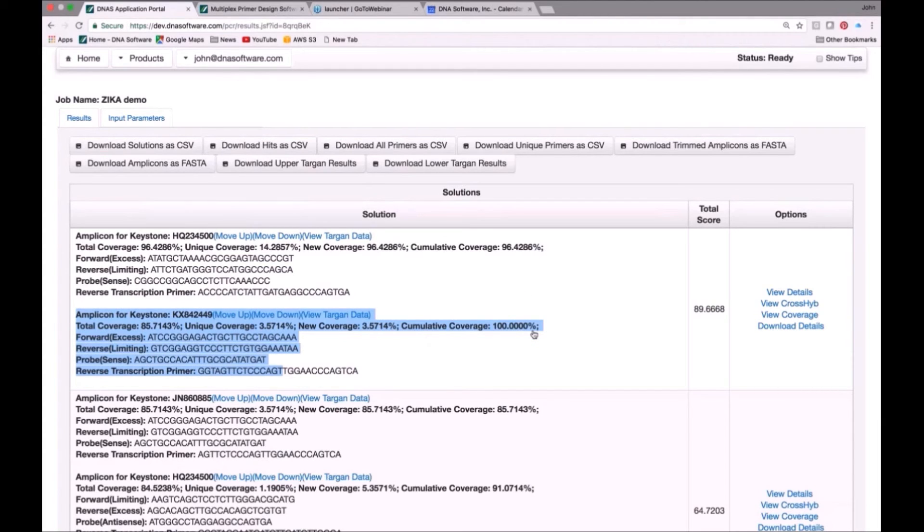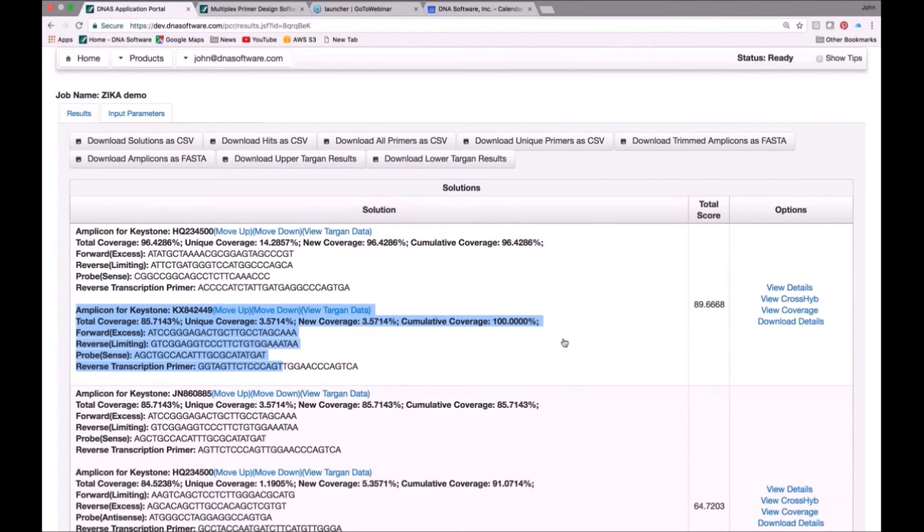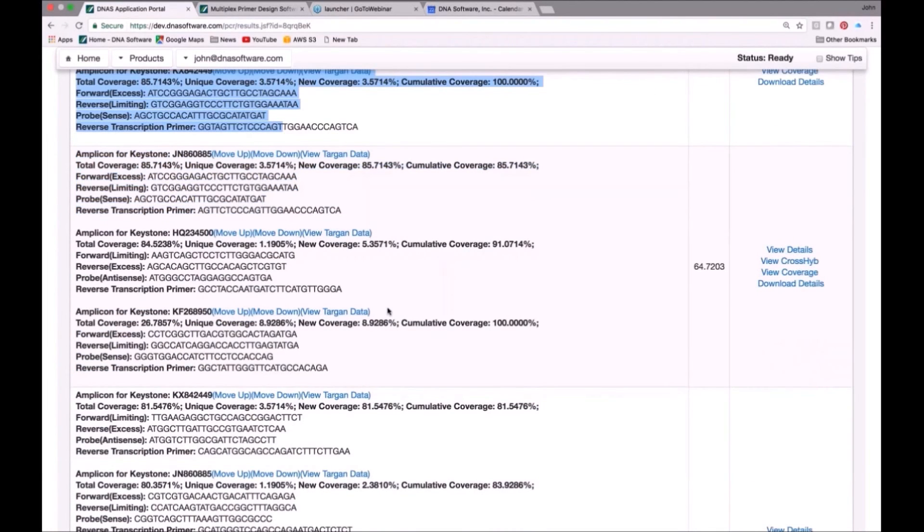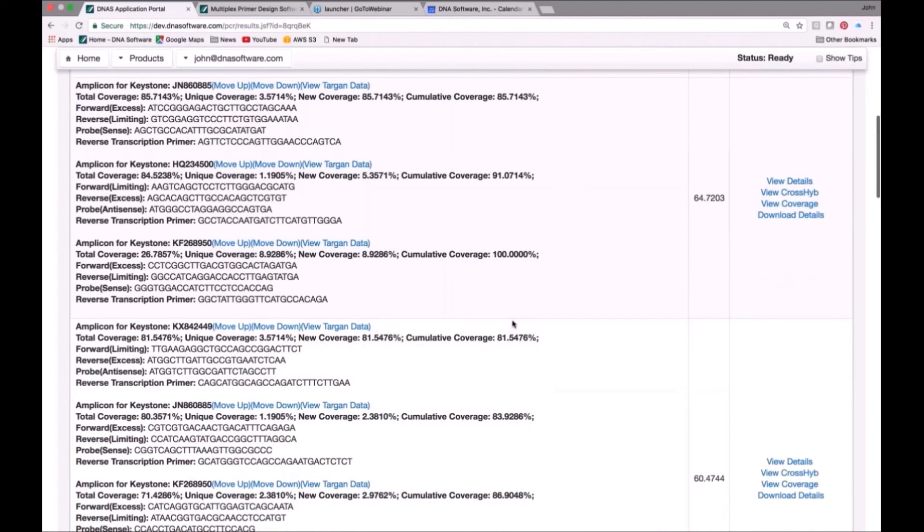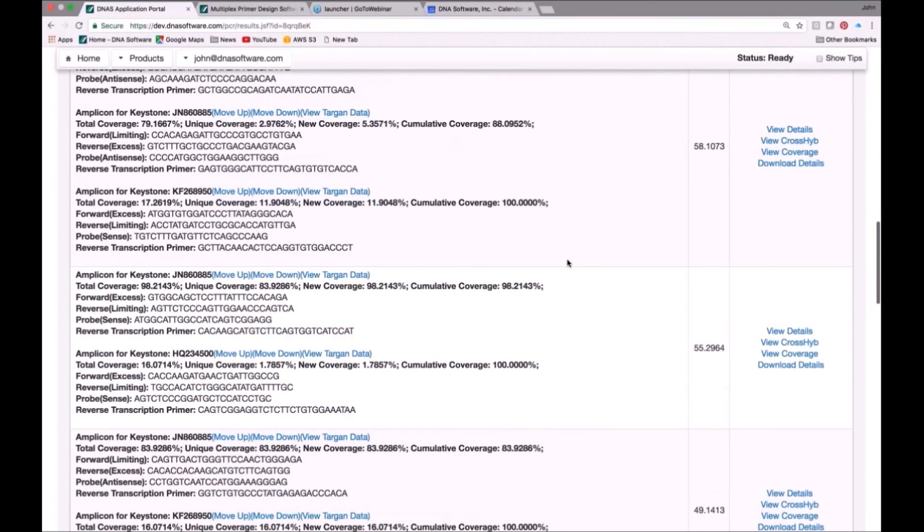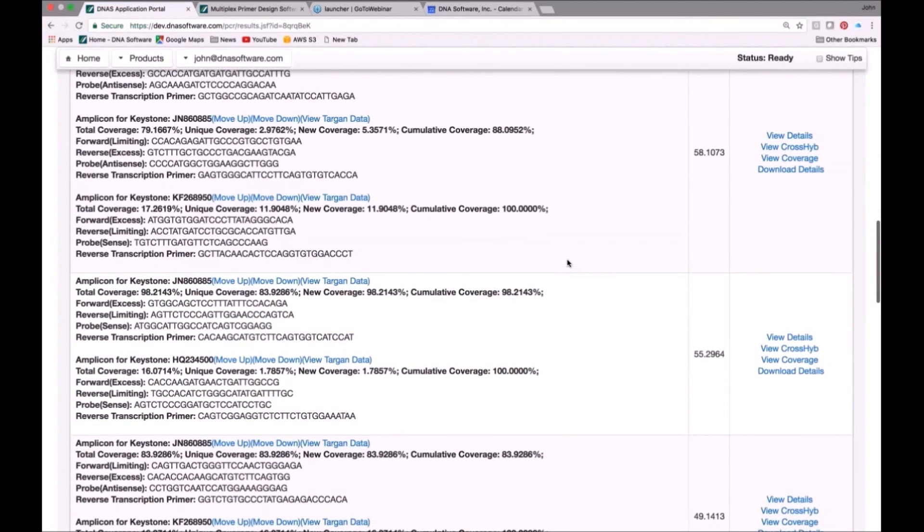I mentioned that we have a set of not just one solution to the multiplex problem, but here's a second solution with three primers that were required to solve that one to get a cumulative 100%. Here's one with four different primer sets that were required. Here's one with three primer sets, etc. Here's one more down here with two primer sets. It's actually an excellent solution as well.